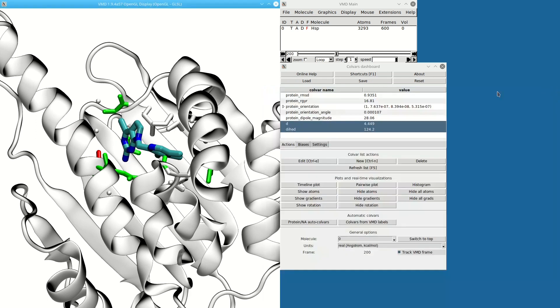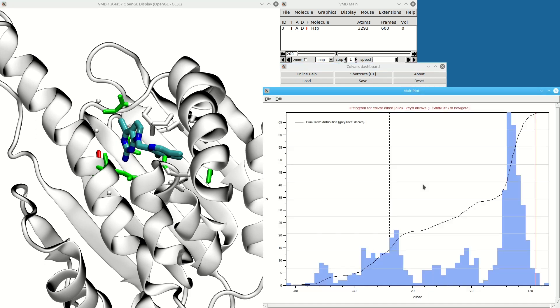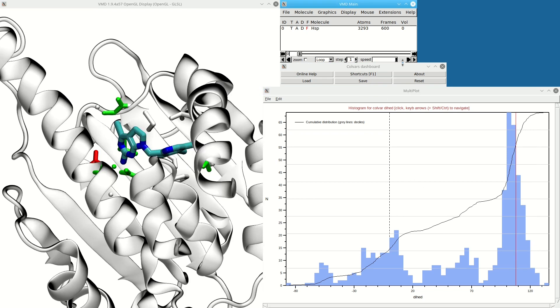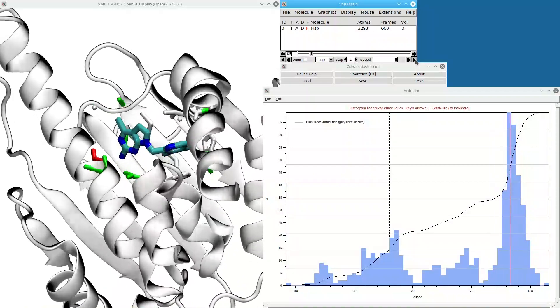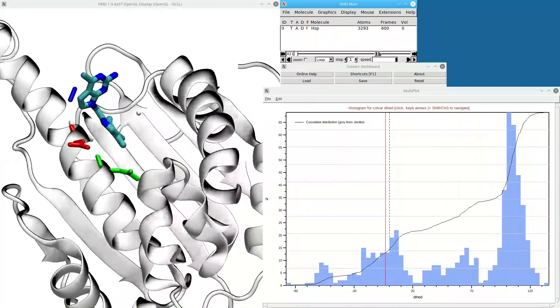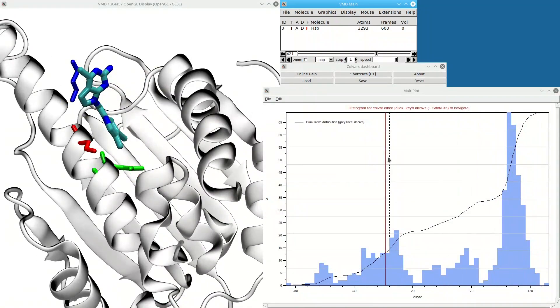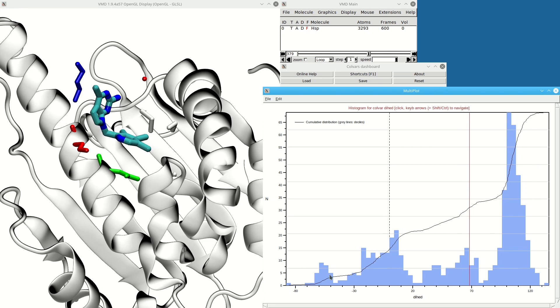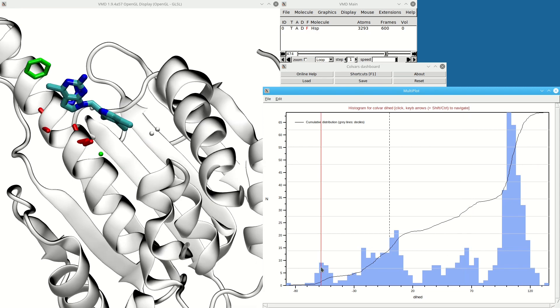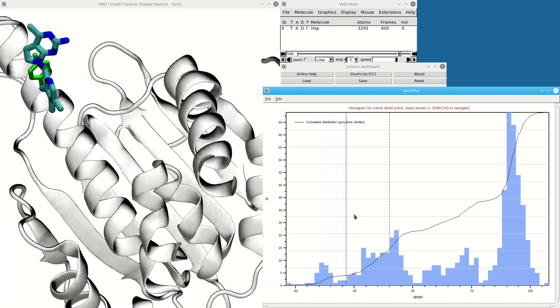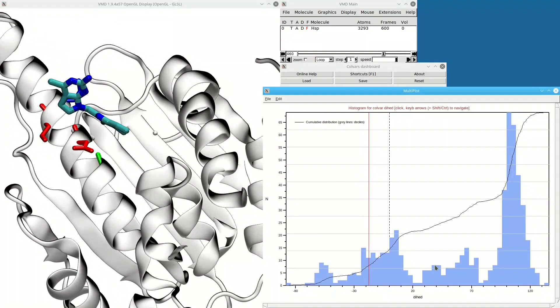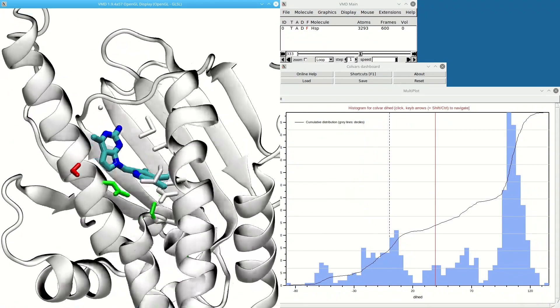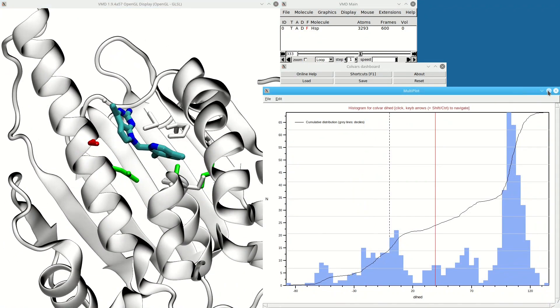Now a different plot I can do is a histogram plot for the dihedral variable, which shows me that there's a number of discrete conformations for this ligand. I can explore them by clicking on different modes in the histogram, which again takes me to the relevant frames in the trajectory. I can also use the keyboard to explore this.